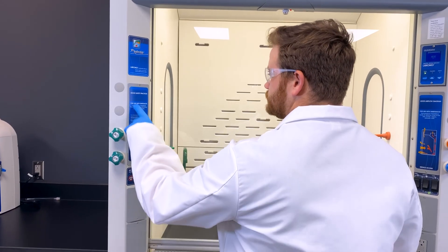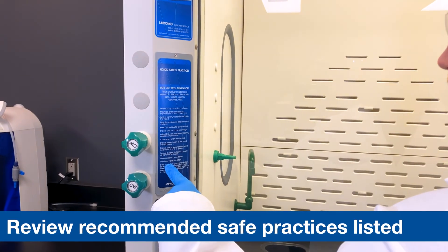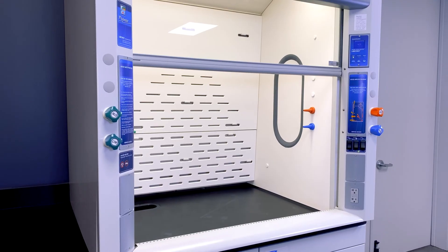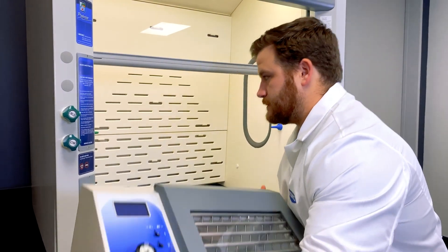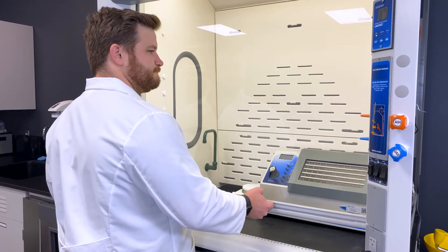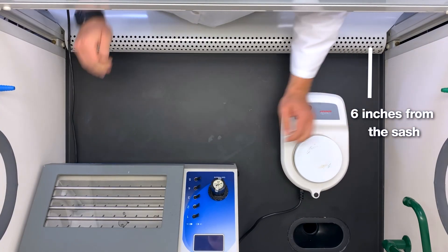Fume hood safety should be taken very seriously. You should regularly review the recommended safe practices listed on your LabConco fume hood's corner post. Do not place your head inside the hood. The fume hood interior should be considered a contaminated space at all times. Potential loss of containment increases significantly at distances within six inches of the plane of the sash.